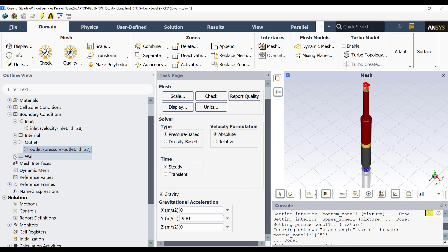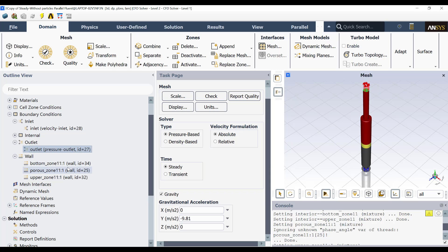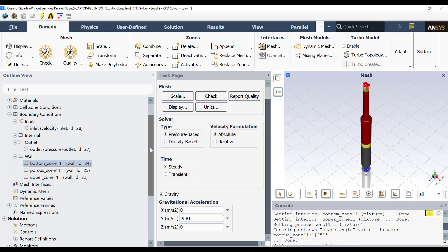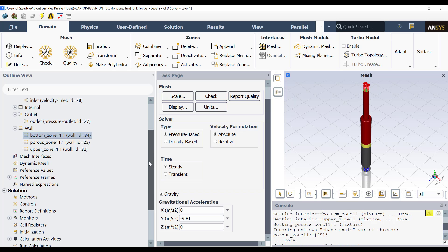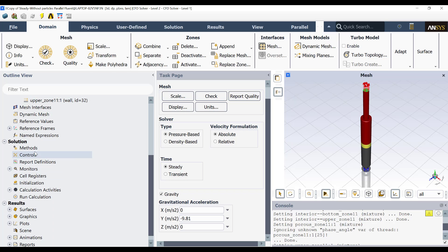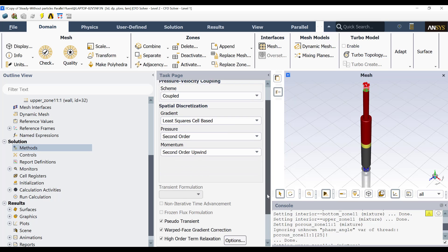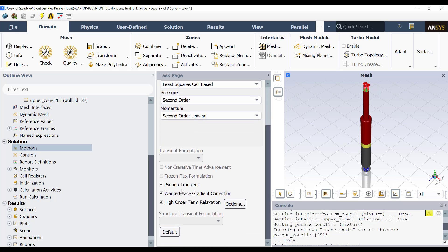Then the other boundary conditions are the walls of the bioreactor. And they are stationary walls and no-slip boundary condition. This is the default boundary condition for walls. Then in methods, I am going to use the coupled scheme, second order for pressure and momentum. And by default, I am going to use the pseudo-transient approach.